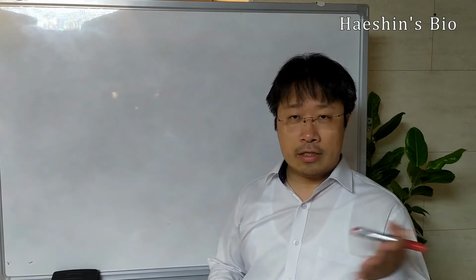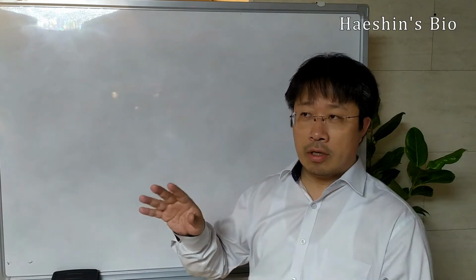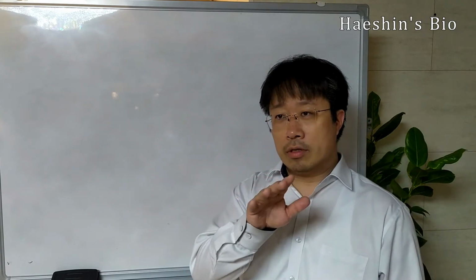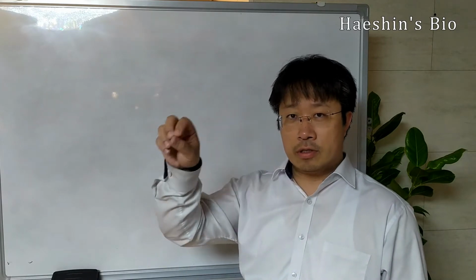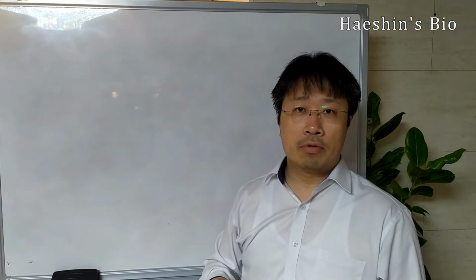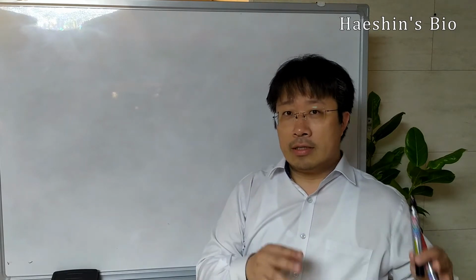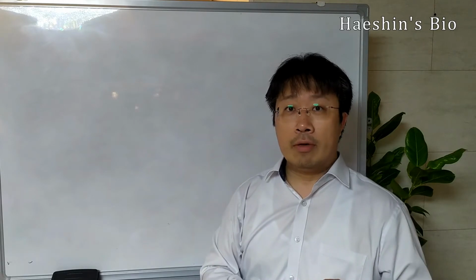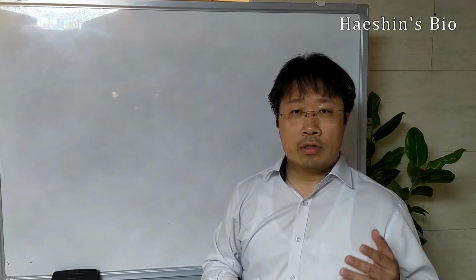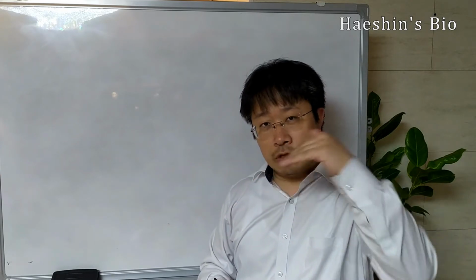Okay, so the last topic was X-ray photoelectron spectroscopy. We can deal with a lot of aspects of XPS, but the reason for last time was about the bio interface, which has a surface and then serum protein as well, and we analyzed how to analyze such thin layers of protein on the surfaces by spectroscopy. So last time the XPS gives you the chemical information of the protein or DNA or biomolecules on our surfaces. So today, how to image the molecules on the surfaces.